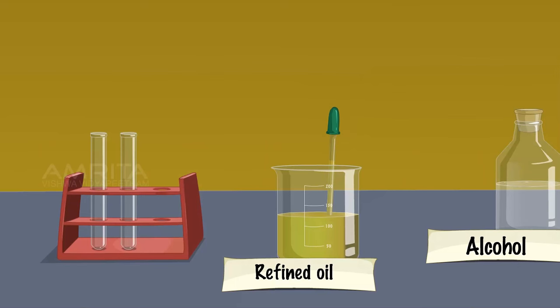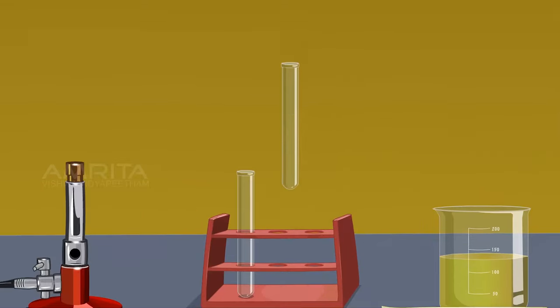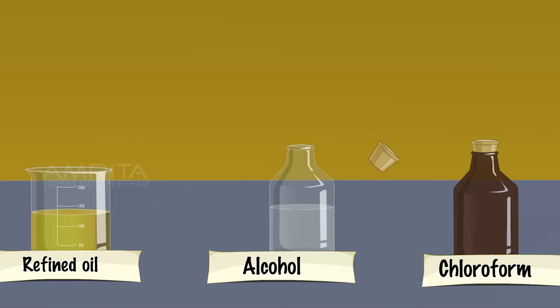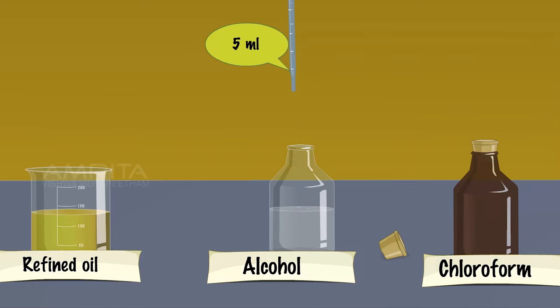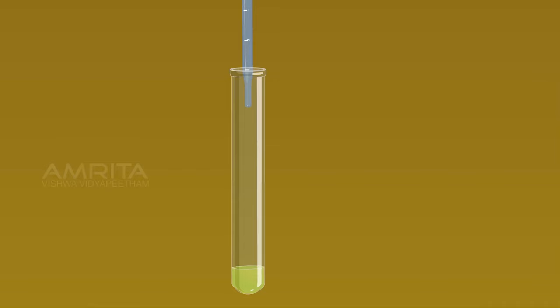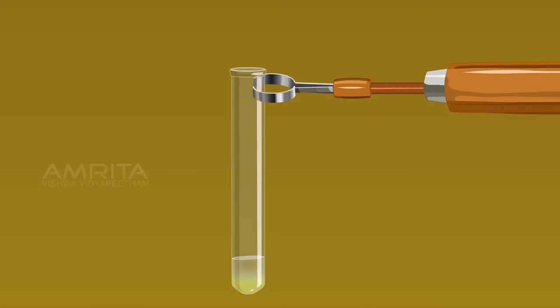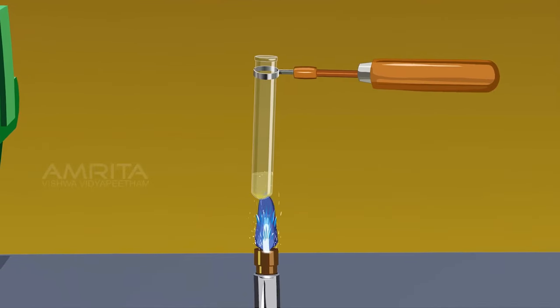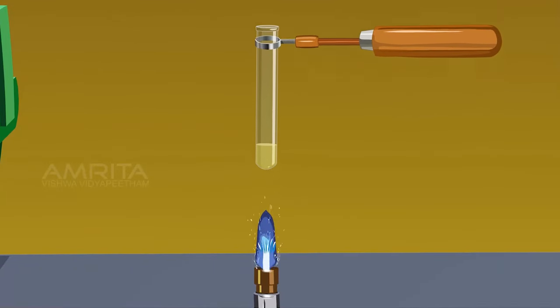Now take a small amount of refined oil in another test tube. Using another dropper, take about 5 ml of alcohol and add it into the test tube containing refined oil. The oil forms a lower layer. Hold the test tube with the test tube holder and heat it over the Bunsen burner. The lower layer of oil dissolves on heating.